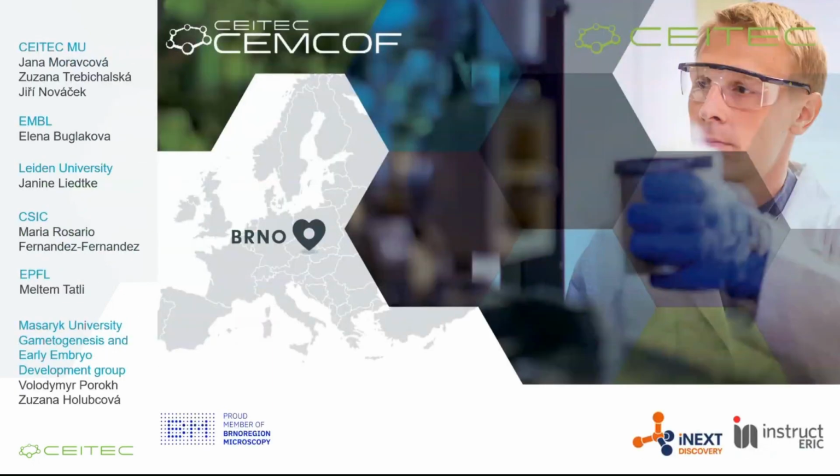But for verification of vitrification, you need to go to TEM. We saw a lot of nice images in SEM, and when we went to the TEM from the same place, we saw some devitrification. Maybe it happened during transfer, but for the final devitrification verification, we used TEM.